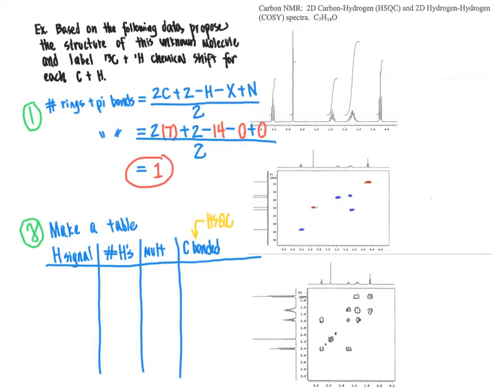So proton signal, I'm just arbitrarily going to start from the most downfield end of this spectrum, where we see a signal here at what I will say is 2.4 ppm. So I'm going to go ahead and write on my chart here 2.4 ppm.